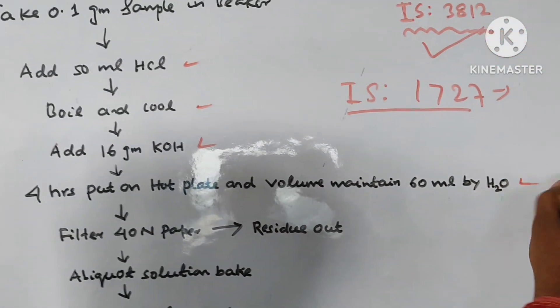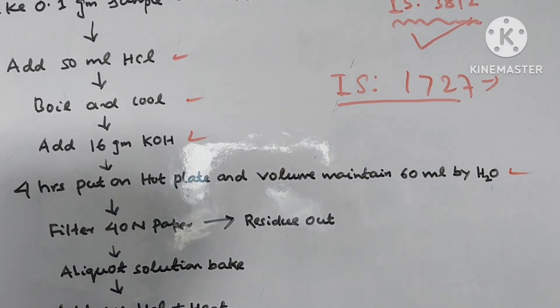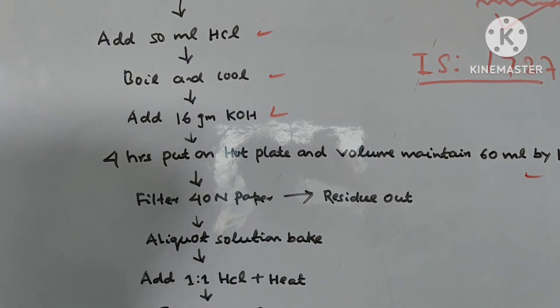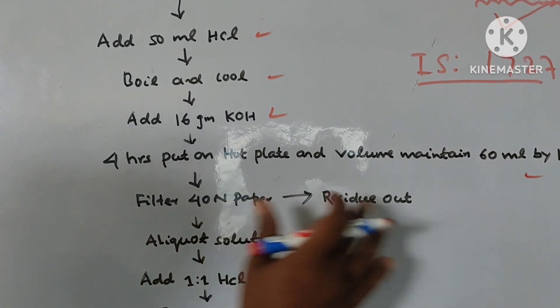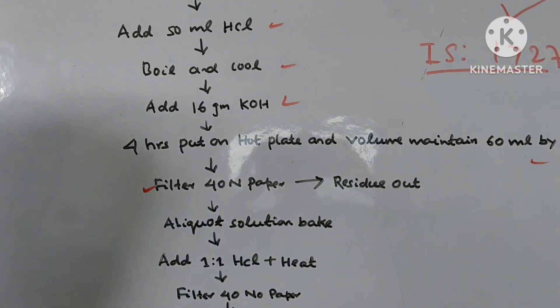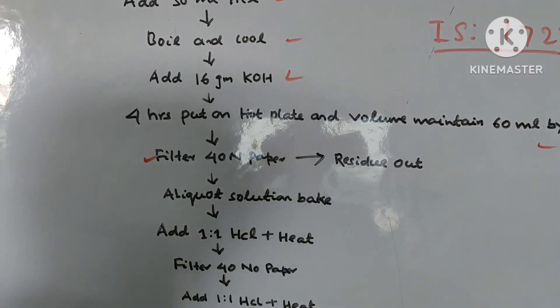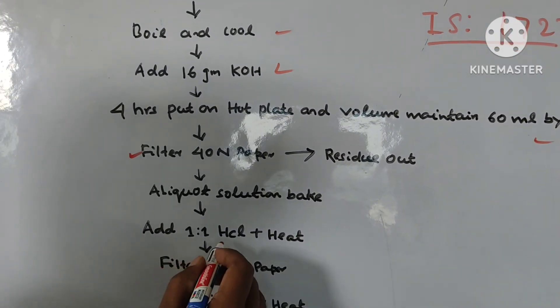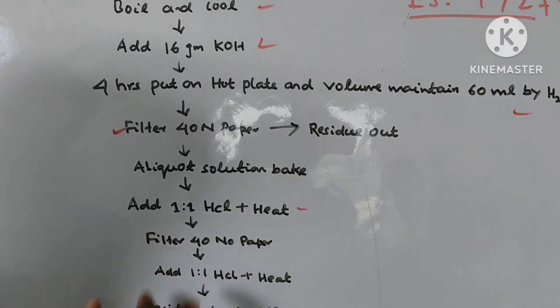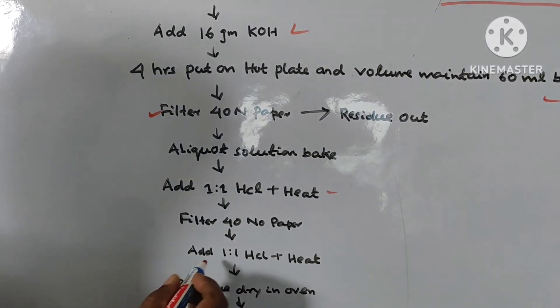Put on hot plate for 4 hours, and maintain the volume to 60 ml by adding water. After 4 hours on the hot plate, filter the solution. The resultant aqueous solution — bake it. Then add 1 to 1 HCl with some heat to that aqueous solution, and then filter again.